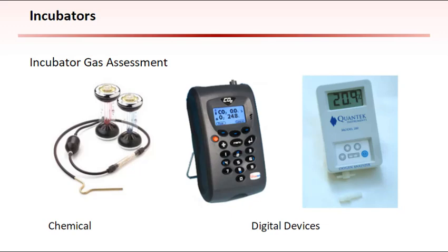The digital displays on the front of incubators should never be viewed as a definitive reflection of the actual environment within the incubator. Concentration of gases within the incubator, just as temperature within the incubator, should always be validated and monitored with an external, independent device. A potassium hydroxide red dye chemical analyzer has been the traditional method for determining incubator CO2 concentrations.